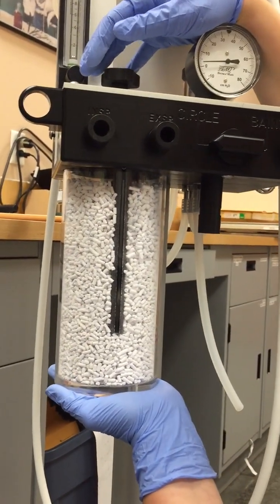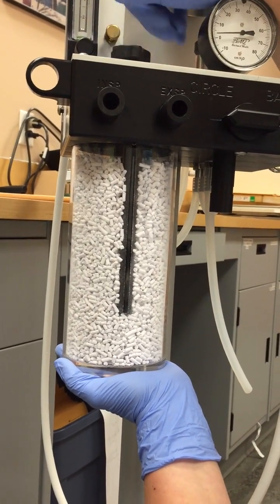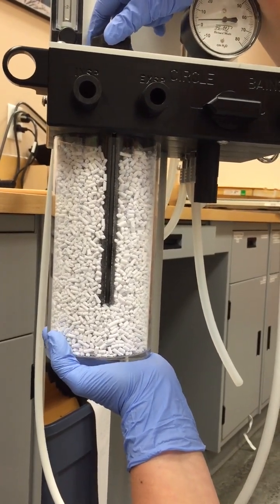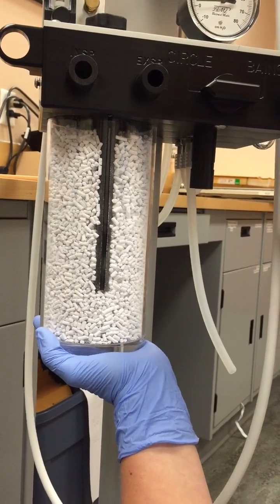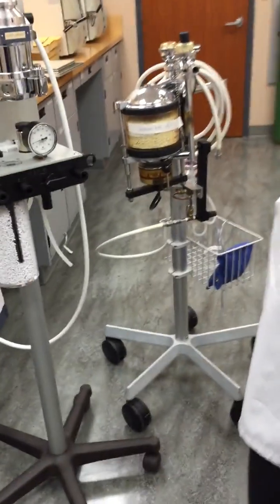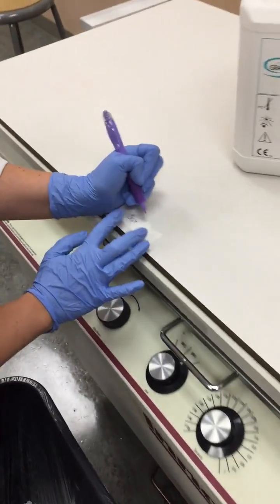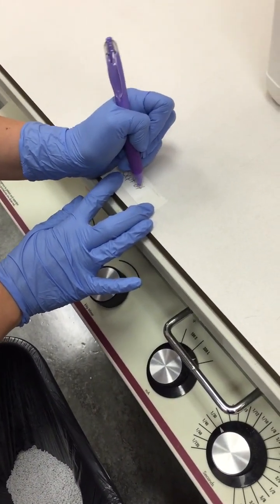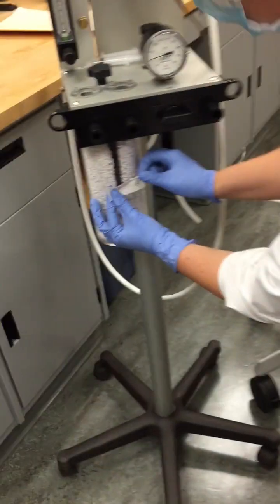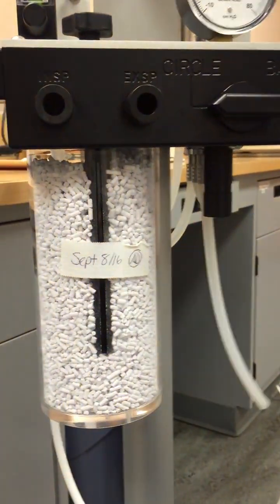Now I'm holding and pushing up with my left hand, and then up here I am turning the locking knob clockwise till it's finger tight, and I always just give it a little shake to ensure that it's in there and secure before I let go. From there, I'm going to take my pen. I'm going to write today's date on that little piece of tape that I had to cover the notch, and my initials. I'm going to take that piece of tape, stick it on the canister, and we should be good to use it.